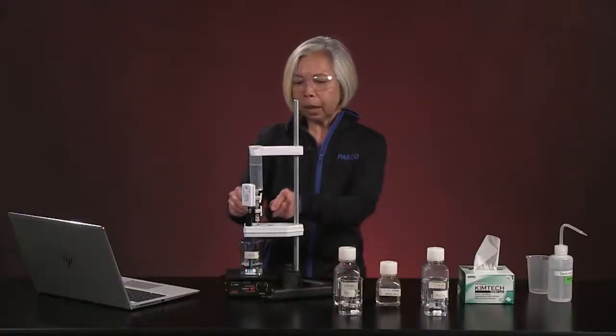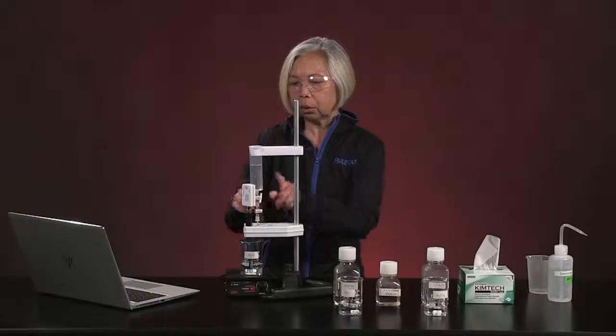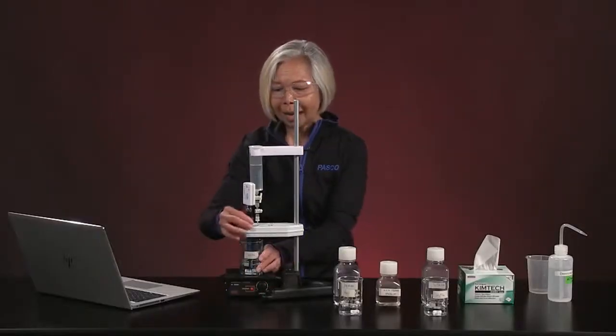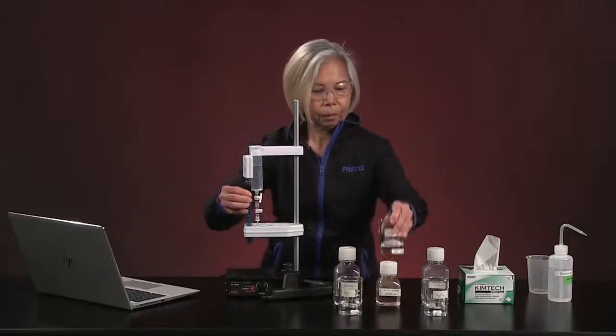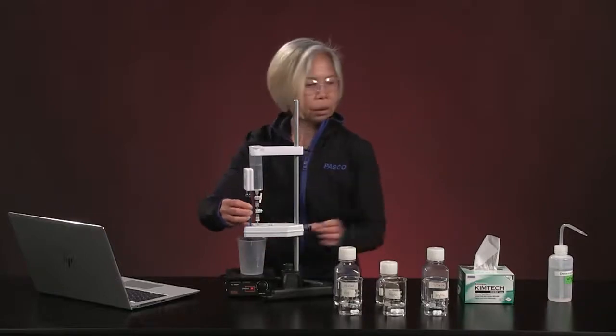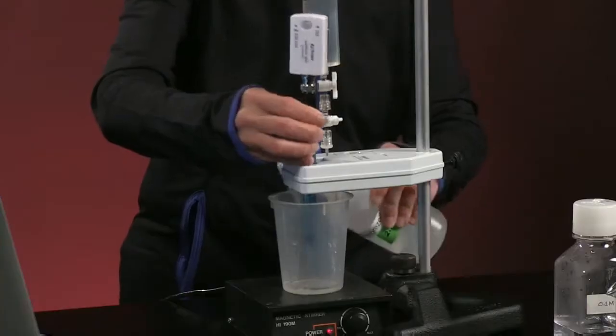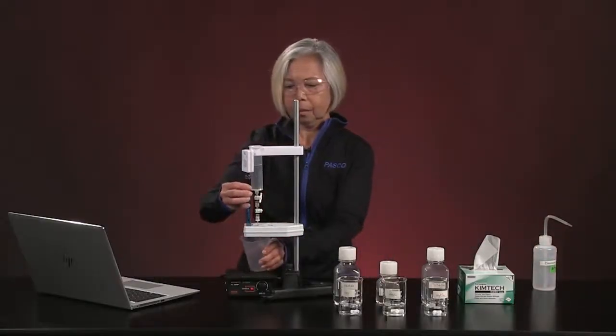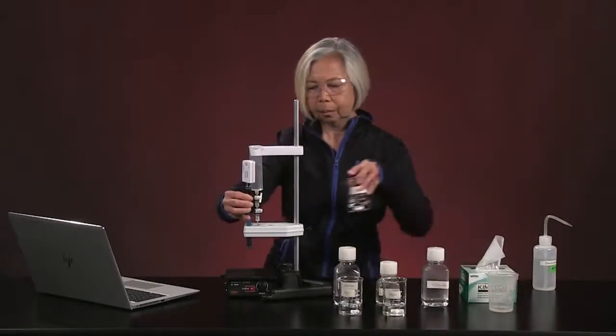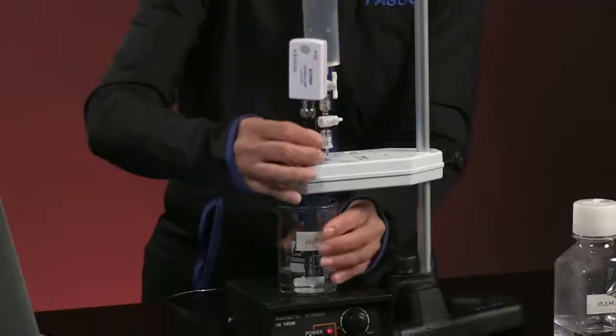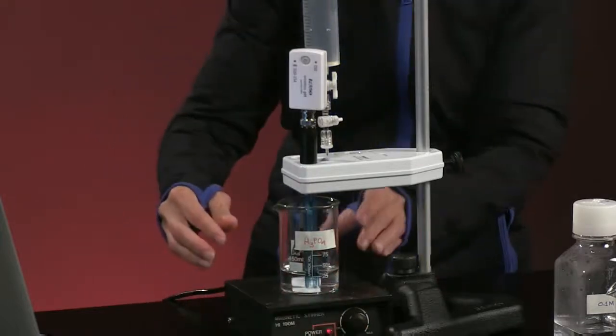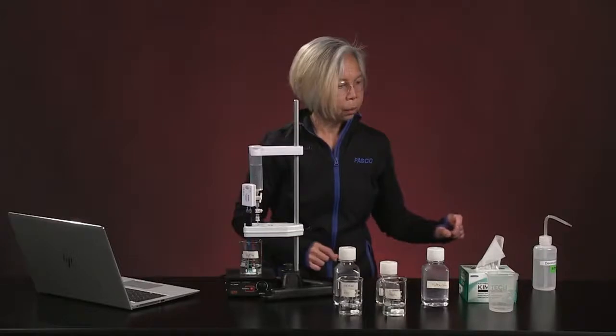It looks like we've come to the end of our titration of the weak acid. I will now turn off the titrant. And we will switch to our last acid for today. Before that, we will rinse our pH sensor, hose it down nicely.